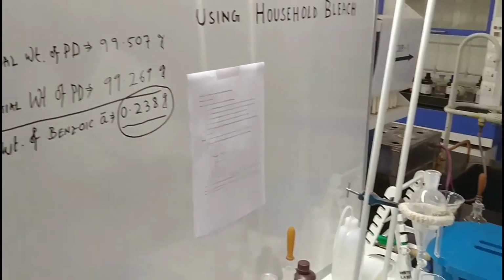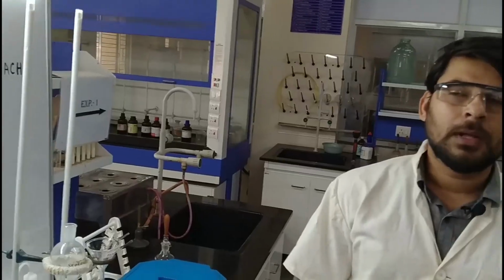Okay, so that's all. We got the benzoic acid. So that means it's over.